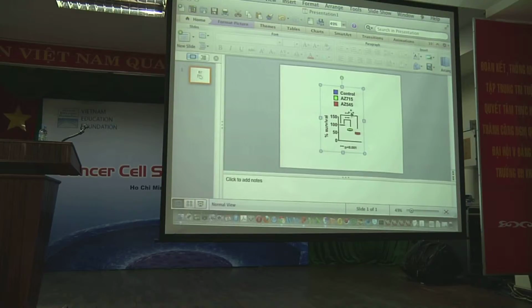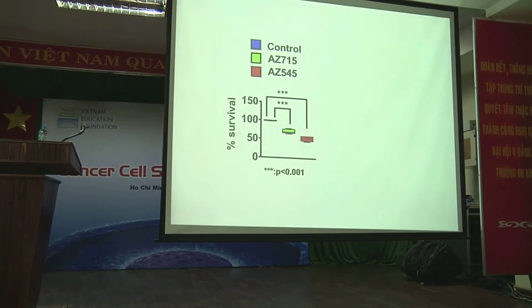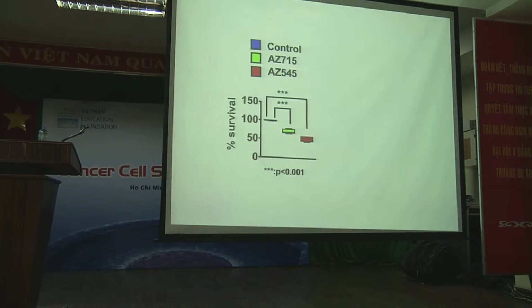Okay, so now it's right here. You see? So you can see in a short amount of time we can view the graph very easily and very colorful. It's much easier than Excel. And what you have is also very reliable and accurate statistical tests.